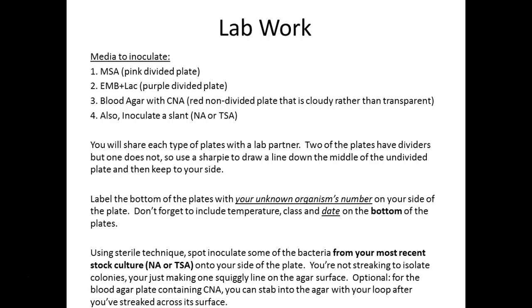So for next week, you'll notice everyone picked up your homework for next week. Next week, we're going to look at your results from the plates that you inoculated today, which are the mannitol salt agar plates, the pink divided plates, the EMB plates, and then I had a few of you do the blood agar because it'll help confirm your organism.